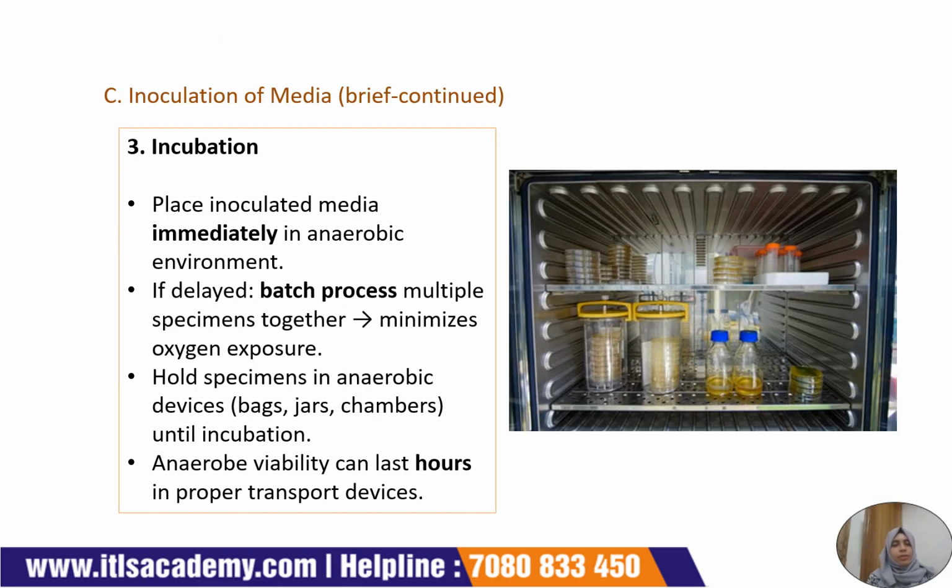Now, for incubation, we first have to place the inoculated media immediately in the anaerobic environment, and if processing is delayed, batch processing of multiple specimens can be performed together. That minimizes oxygen exposure. We have to hold specimens in anaerobic devices such as bags, jars, or chambers until incubation. Anaerobe viability can last hours in the proper transport devices, as mentioned in the previous slides.